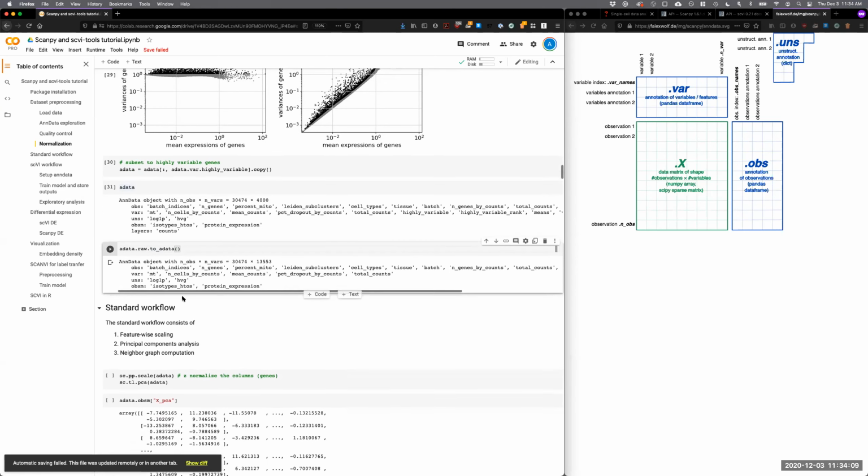Hey, Adam, can I ask a quick question? Yep. What's the purpose of the copy function? I see that you threw that out there. I mean, this is very minor, but why even have that? Why not just subset without the copy? Is there something that it does?